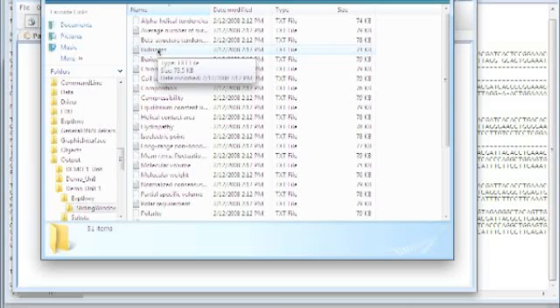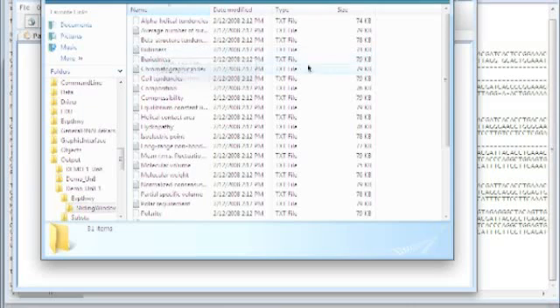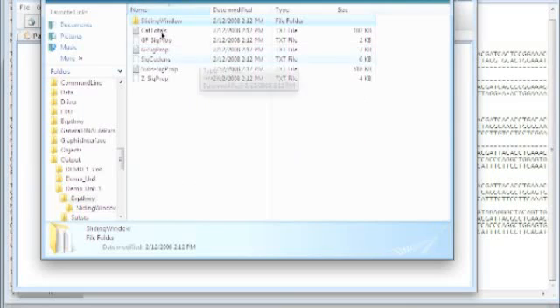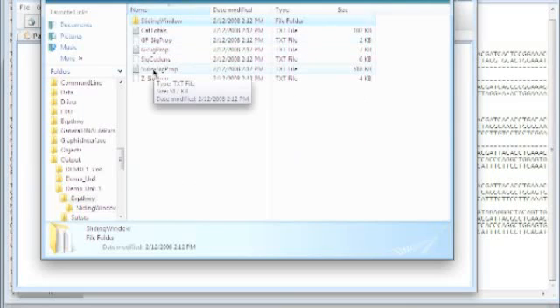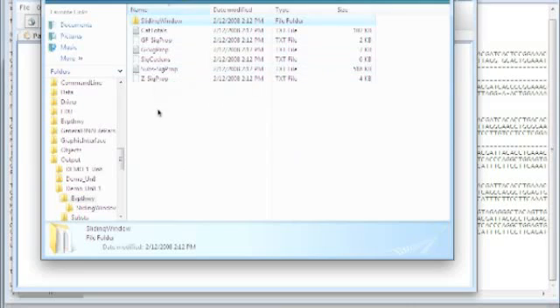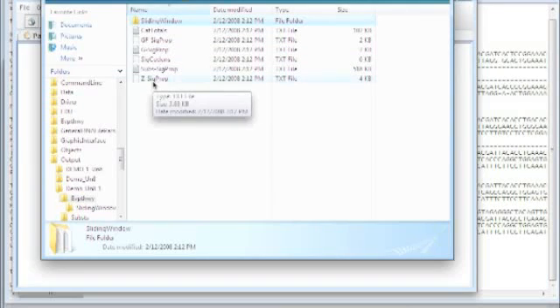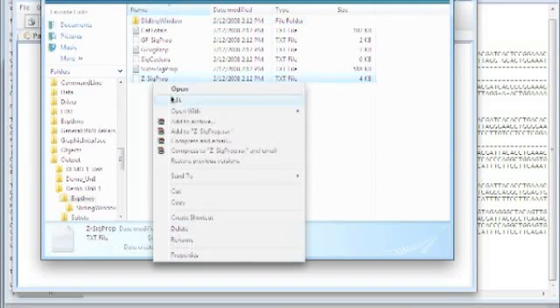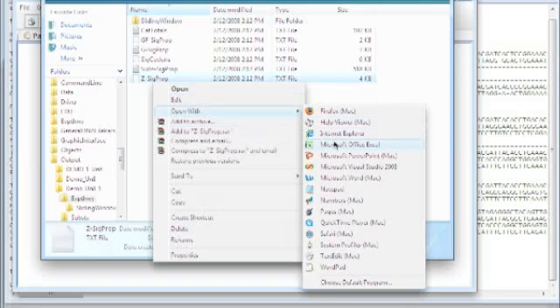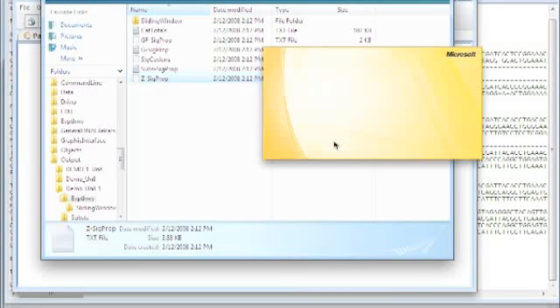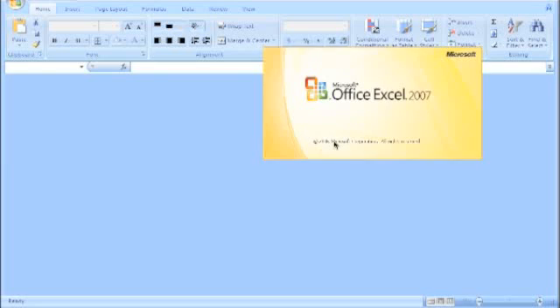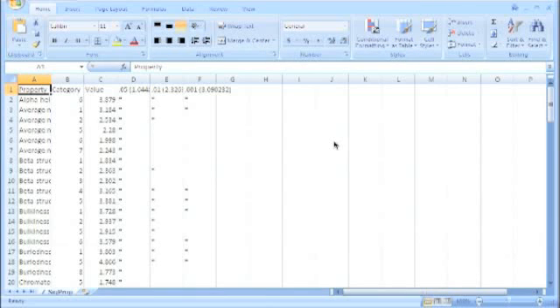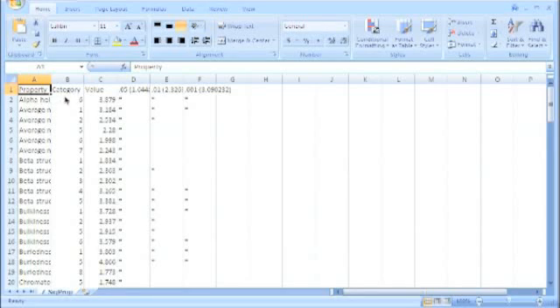So for example, bulkiness information is contained in that file. So now that we have all this information, how do we tell which one of these was really important? Or how do we tell where there was selective pressure? We're going to move up back one directory and open up this zsigprop file. It's kind of messy, so you open it with Excel and the contents are more easily discernible. So basically, this file has one column with the property name, and then one column with the category. Now, remember these are the categories one to eight, with eight being the most significant or most drastic change and one being a smaller change.